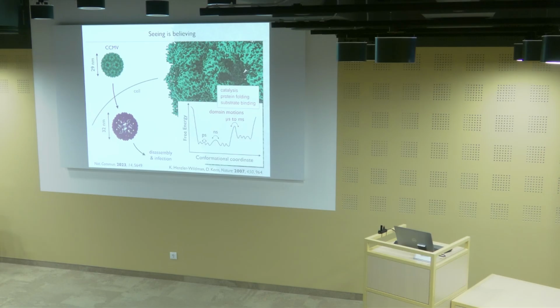So really, what we would need to understand this process is a technique that offers microsecond temporal resolution. You could do an optical pump-probe experiment, or small-angle X-ray scattering, and so on. However, that wouldn't tell you the full story. Really what we want to know is, in this reconstruction here, every dot is an atom. And to really understand how this thing works, we would like to know where each of these dots is as a function of time. So we also would need something that has near-atomic spatial resolution. And a good technique to observe this process simply doesn't exist.